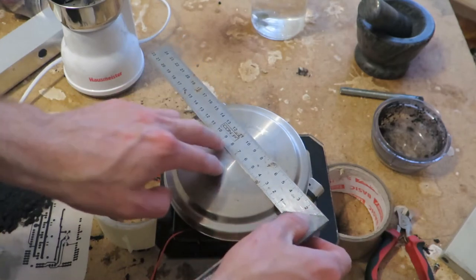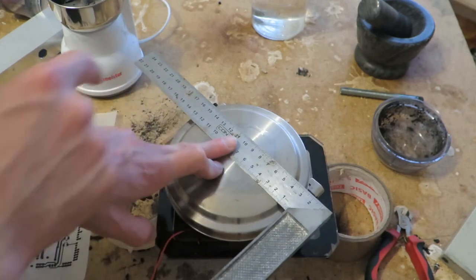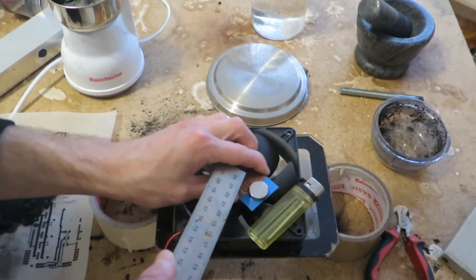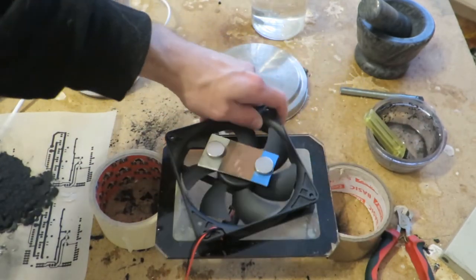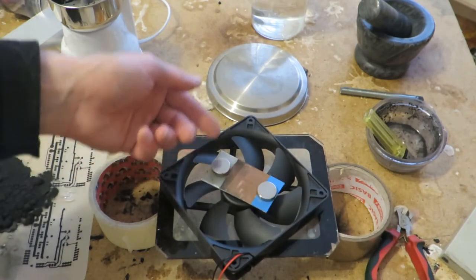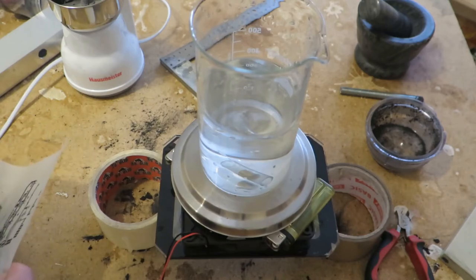Maybe you were interested in some dimensions. This thing is about 135mm at the lip, and the heated surface is 120mm. I am using a 120mm fan. These are 18mm diameter magnets and 5mm tall. There are two of them - the bottom one holds on to a steel cap that the fan blades have, and there are two to just amplify the magnetic field strength.